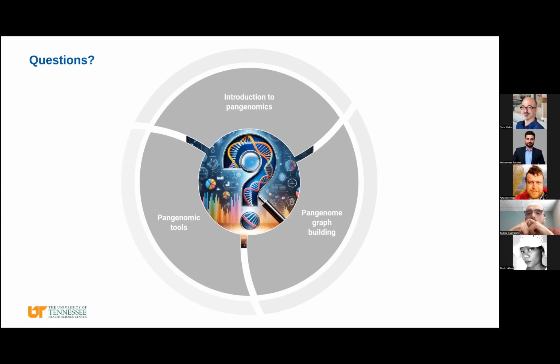Yes, Chris, you can ask a question. Yeah, so I think when we did this in the workshop, we used phased assemblies, right? Or it might have been some phased assemblies, some non-phased. So we had the maternal and paternal assemblies from hifiasm. Is that correct? Sorry, in the example that I've shown you, in the HPRC we used HiFi-based assembly plus trio data, so they are almost fully phased.